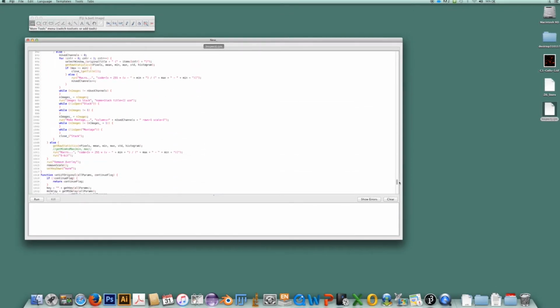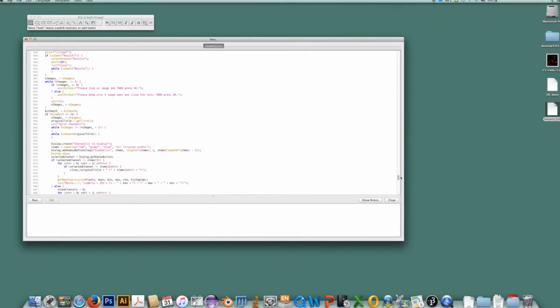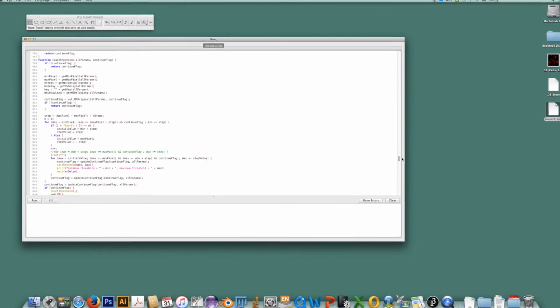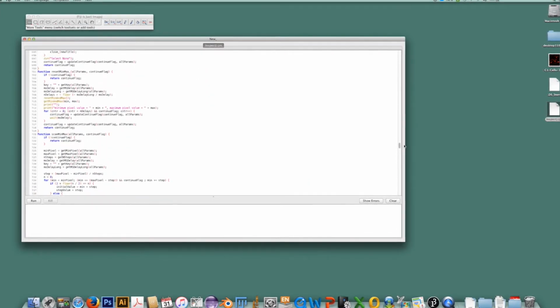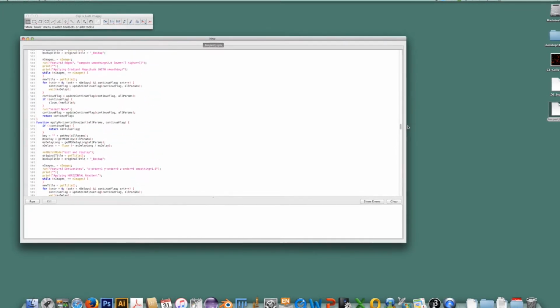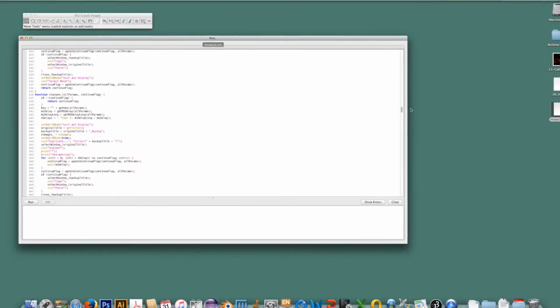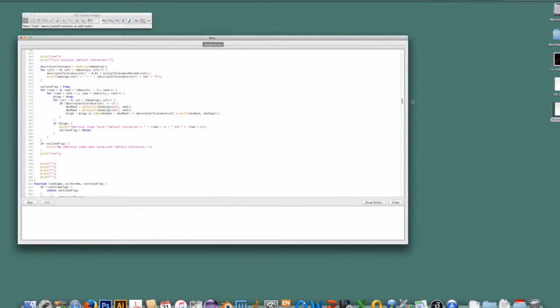This software is open source, so if you are a programmer, feel free to take it and do with it whatever you want. You can extend or modify it, or you can just take parts of it to use somewhere else. We'd be happy, that's completely up to you. But if you do not have a background in programming, this video will show you how easy it is to change the important features of InspectJ.